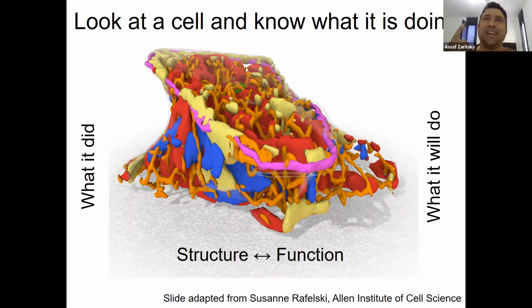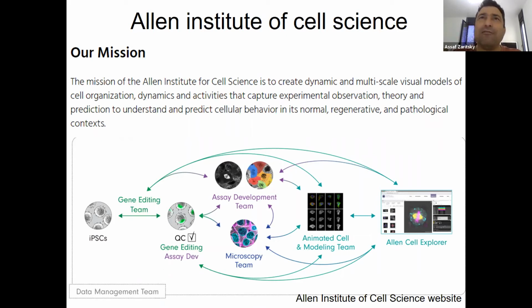So in 5 years, what they reached is the ability to brag, and come with some biological insight, but to brag that they can image six different organelles in the same cell and look at their interactions. So this is a huge limitation. Now, there is a lot of effort today to try to tackle that. And a lot of it is actually philanthropic efforts.